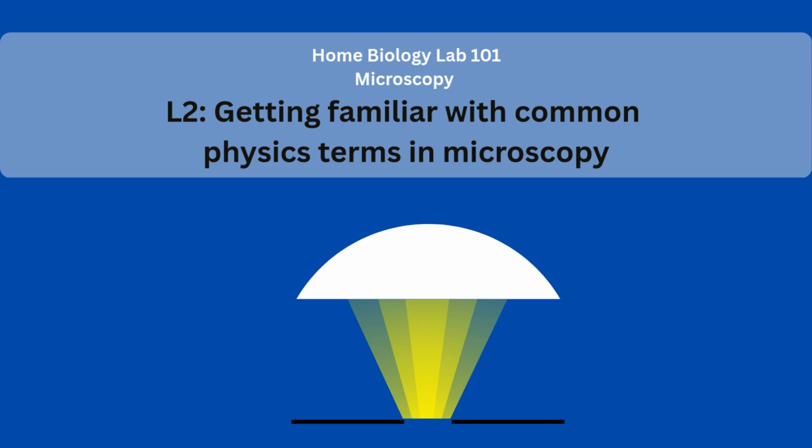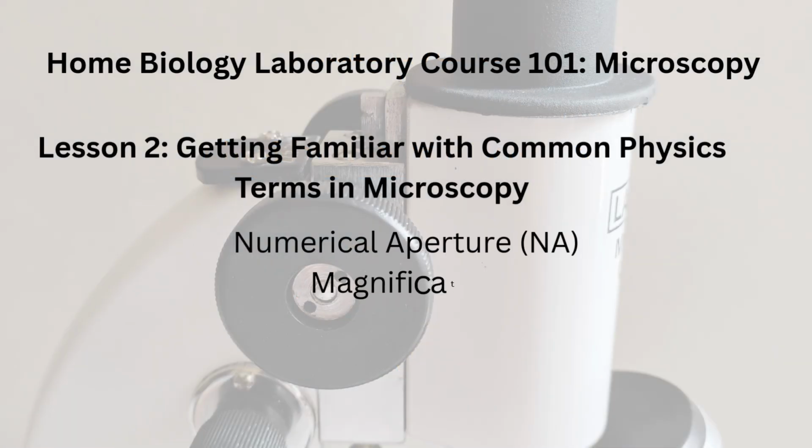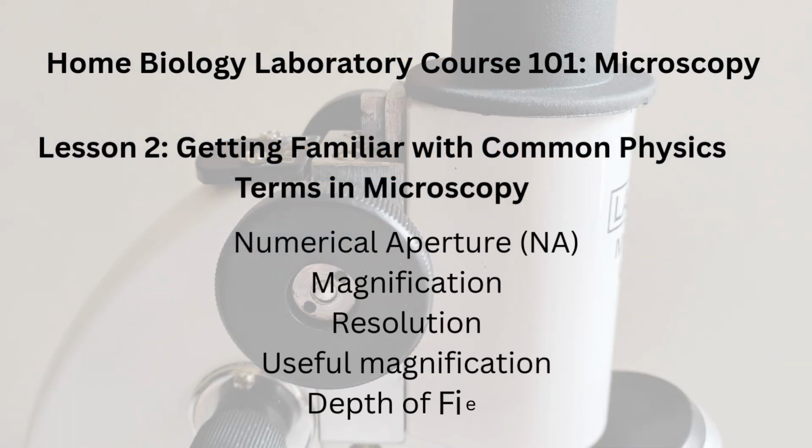Welcome. In this video, we'll explore some key physics concepts which are essential in understanding how microscopes work. So we'll learn about numerical aperture or NA, magnification, resolution, useful magnification and depth of field.